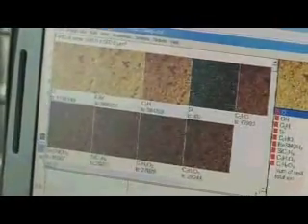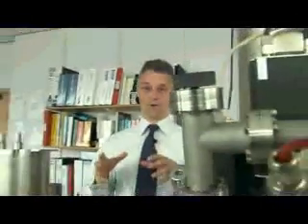So nanotechnology, most people think about it as being very tiny, a small scale, and that's partly what it's about. But it's also, by making something small, it's important we give it a new property, something different. So nanotechnology is about not only making things small, but actually having a new function. For example, we can deliver medicines we otherwise wouldn't be able to deliver simply by making it small. So we have to have instruments like this one here, which enables us to analyse those nanomaterials so we can actually understand, when we make these materials, how they're going to work.